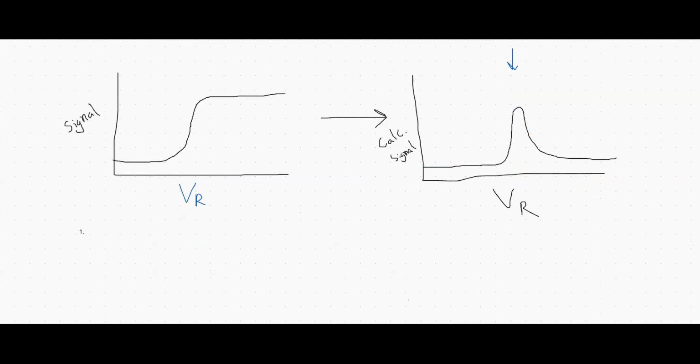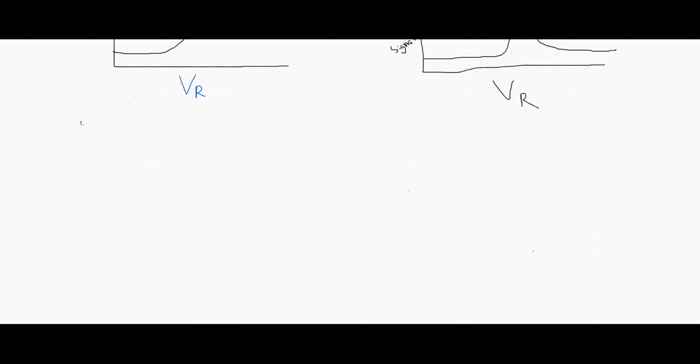When I first was doing the phase transition analysis, I didn't know that you can take a derivative of your line in Unicorn. And if you didn't know that, you can do that, at least you couldn't in the old versions. I don't know about the new version. But anyways, you can just take the step function, take the derivative of it, and then you'll get something that looks like a Gaussian peak.